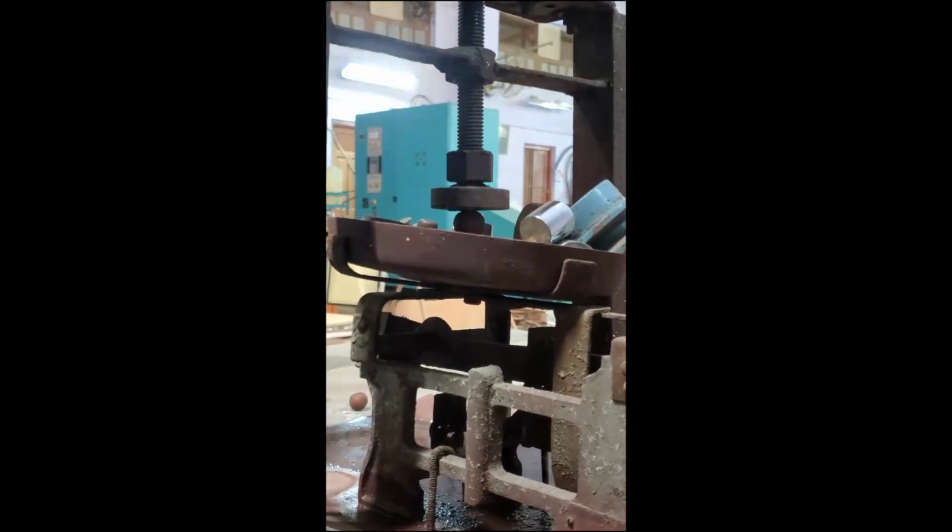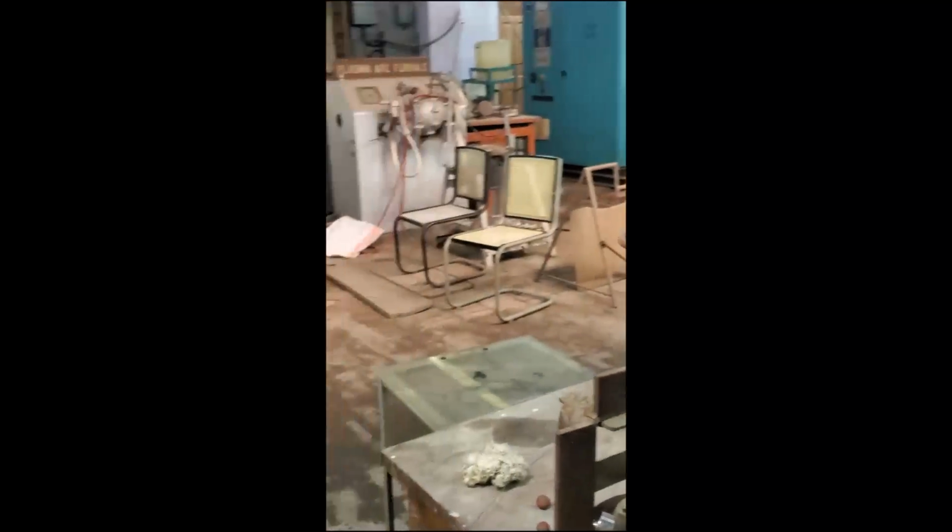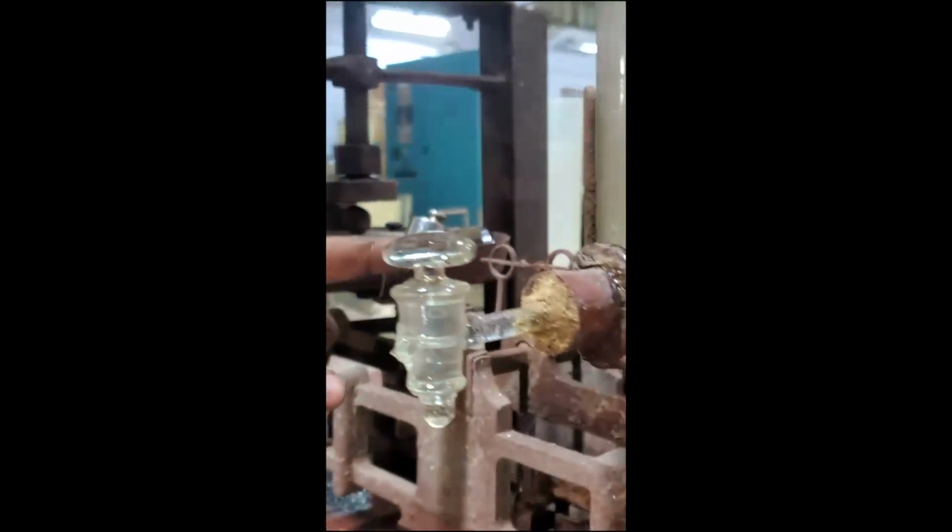So now you can see the pellet is in between this base and the top jaw. So in between these two plates, the pellet is there now. Now see the balance. It is equally balanced.